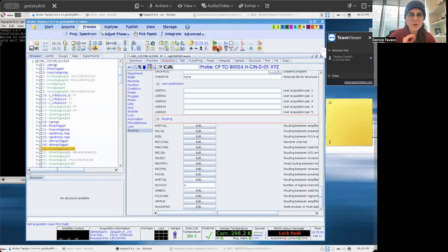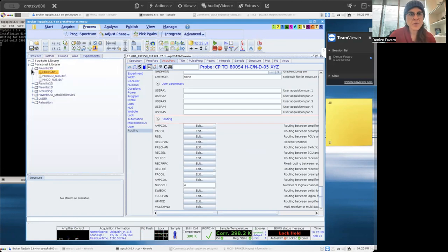On today's video, I'm going to show you something quite useful that I learned from watching one of the Bruker webinars. It's how to have my favorite experiments on one tab.